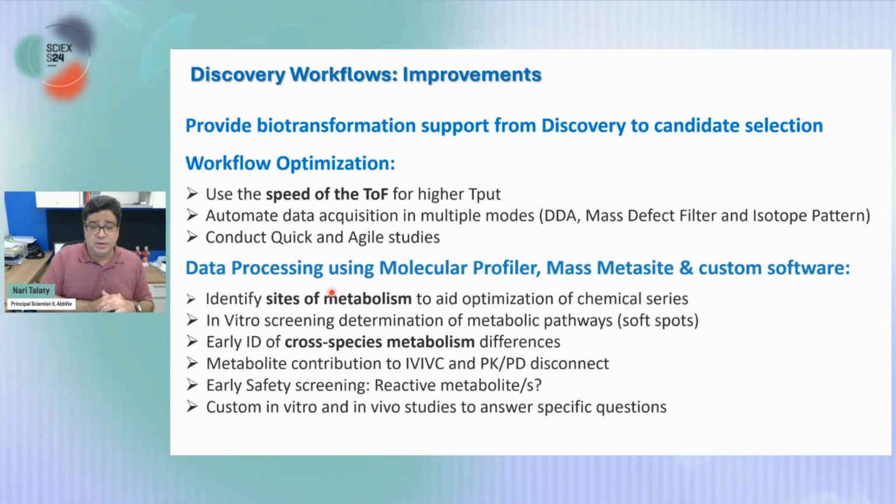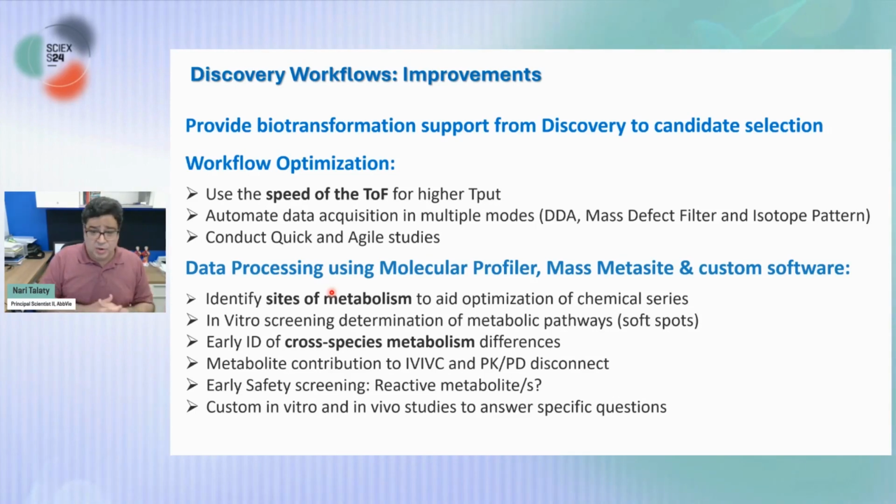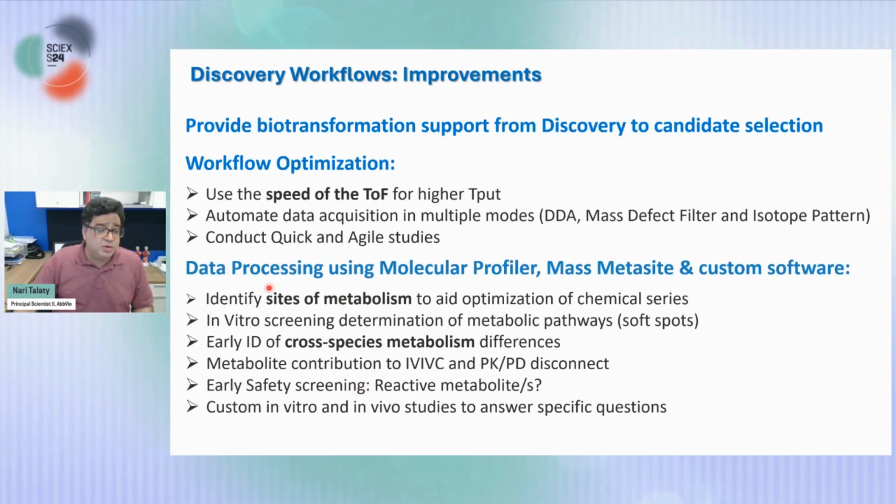One will be dedicated to our development workflow. Now, on the development side, like I said, we cannot miss anything. We want to take every molecule, basically, that we identify, every metabolite, and we want to understand every detail about it. So that's where, again, having the three different modes, doing the different fragmentations, really helps us. We start with our cross species, then we do our ADME studies, and then ultimately all of our human ADME studies as well. So there's a lot of data processing that we want to do.